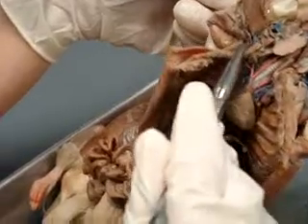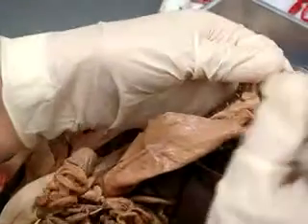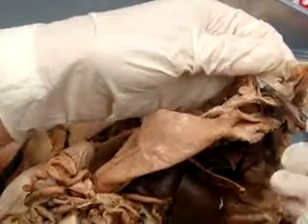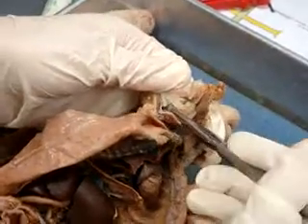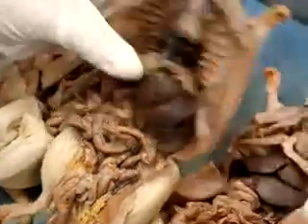The other one goes straight through again and follows through to the arm. And see how it's in the arm right there? That's your brachial artery. Makes sense because it's in the arm, right? Okay, and that's where we end with the arteries of the upper half. Then we use a different rat because his diaphragm's all messed up.